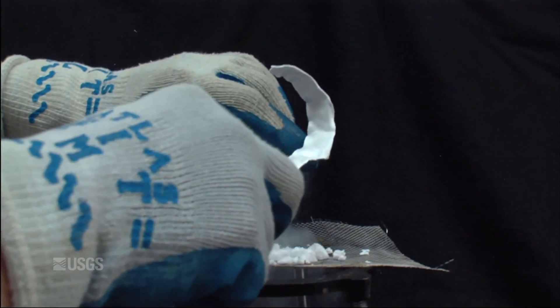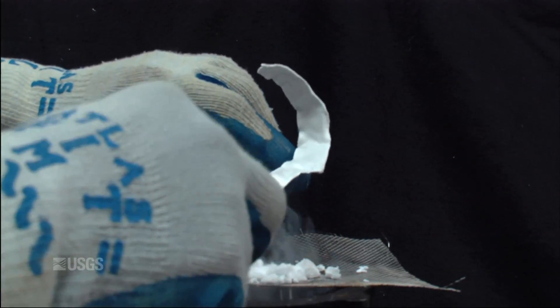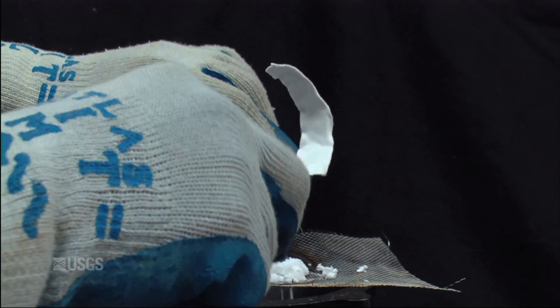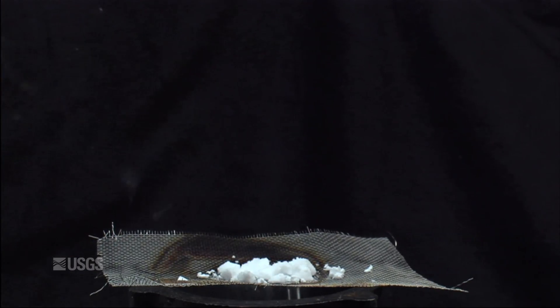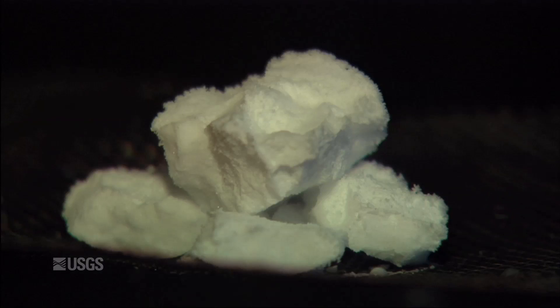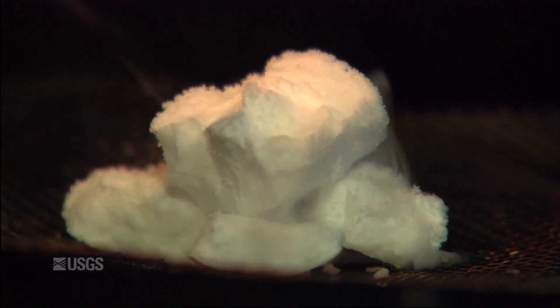This is a Structure 2 gas hydrate — it's predominantly methane with a little bit of ethane in it. We're going to demonstrate how much gas is actually in this. If you bring a cubic meter of methane hydrate from the ocean floor up to the lab and put it on the tabletop, it would release 163 times its volume of gas at standard conditions. So it really is a very efficient way of storing gas. We're going to demonstrate that by lighting the sample on fire.